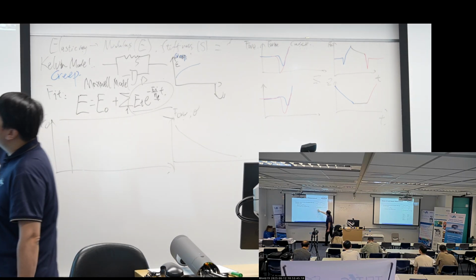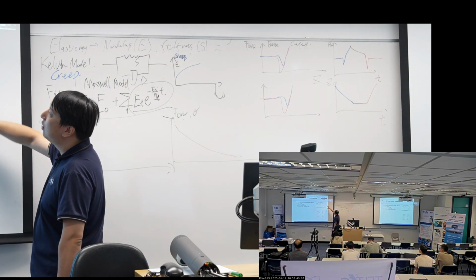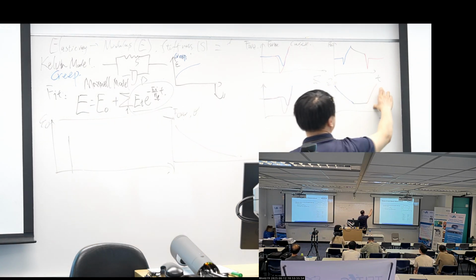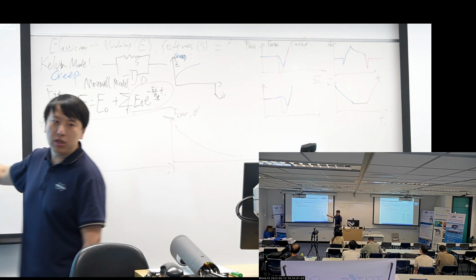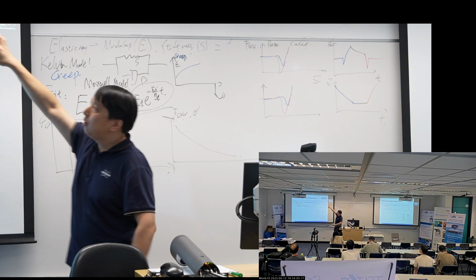So basically, we would do similar things as we did in the previous session. For the force curves, we need to define the ramp size, how long a distance the Z travels, and we need to define the trigger threshold, which is the maximum force.